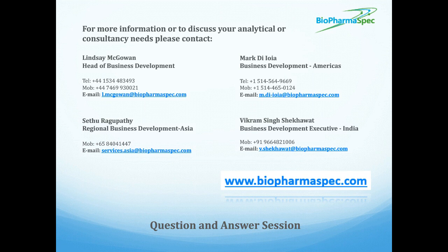I can take that, Gillian. So we'd say every cell system used to create the drug product will have a unique protein landscape. So while it's possible to build on previous libraries, we'd recommend characterizing the cell originator that's been used in the manufacturing process, because different growth or stress conditions can have an impact on the proteome that is expressed.